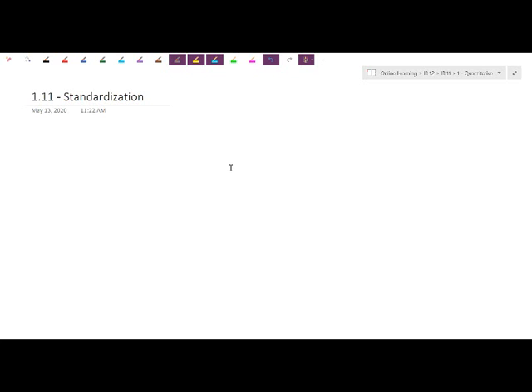So let's just finish off what we just demonstrated for you. At first, I realized I didn't have enough NaOH. My NaOH here, the concentration, this one here would have actually had an error. I didn't do it for yesterday, so let's just assume it's exact for now. So that was 0.92 molar. This one here was the one that they said is give or take 1 molar, which it was.